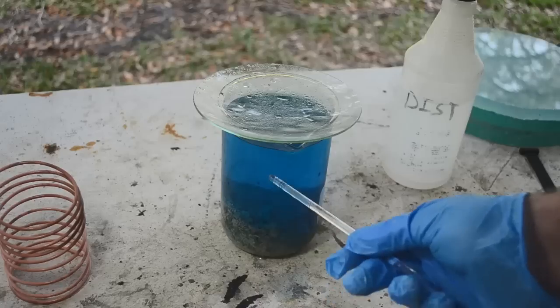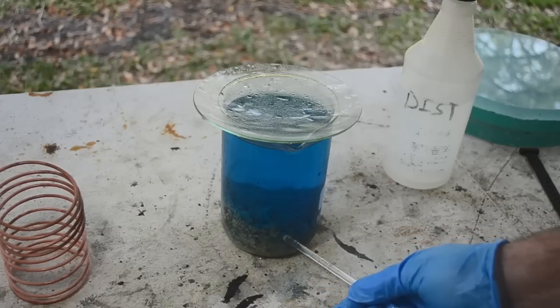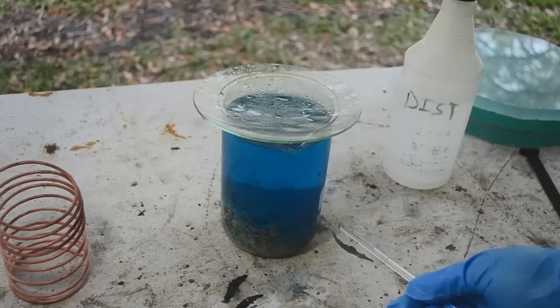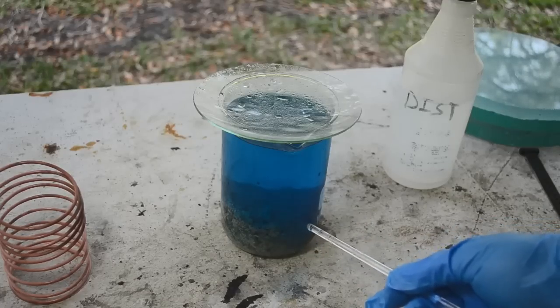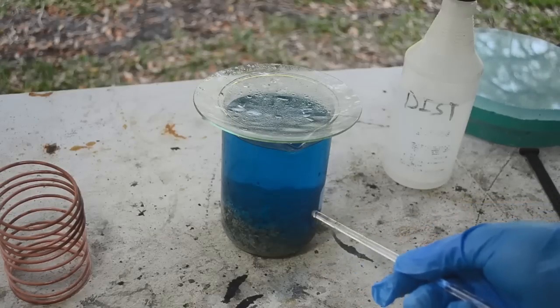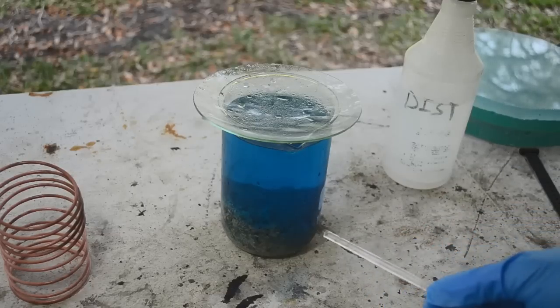And what I think I'm going to do is divide this in half, and we'll do half the silver that way, and the other half I'm going to do with hydrochloric acid, because I know that's not going to dissolve silver. And although the chemistry textbooks will also tell you that hydrochloric acid doesn't dissolve copper either, well, again, it will if there's a little oxygen around to help the process.